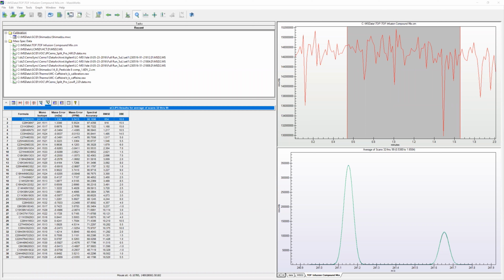Oh, okay. So the question is that when you first got those small peaks to the left of a large monoisotope peak, you broadened your elemental composition by allowing for -H and -2H. Why did the fit curve in black not fit the presumed -2 peak, whereas the -1 peak was fit well? That was simply due to a parameter setting.